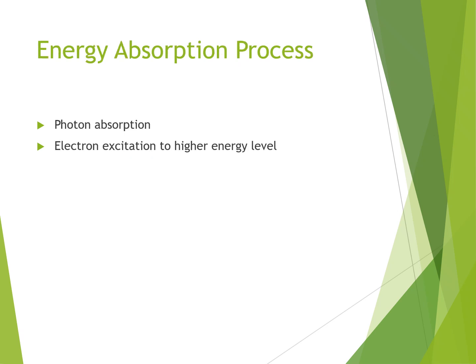When a molecule absorbs a photon, an electron is promoted from the ground state to an excited electronic state.